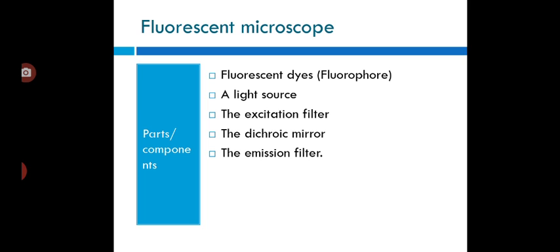Next is the emission filter. The emitter is typically a band pass filter that passes only the wavelength emitted by the fluorophore and blocks all undesired light outside this band, especially the excitation light. By blocking unwanted excitation energy, including the UV and infrared, or sample and system autofluorescence, the optical filter ensures the darkest background.